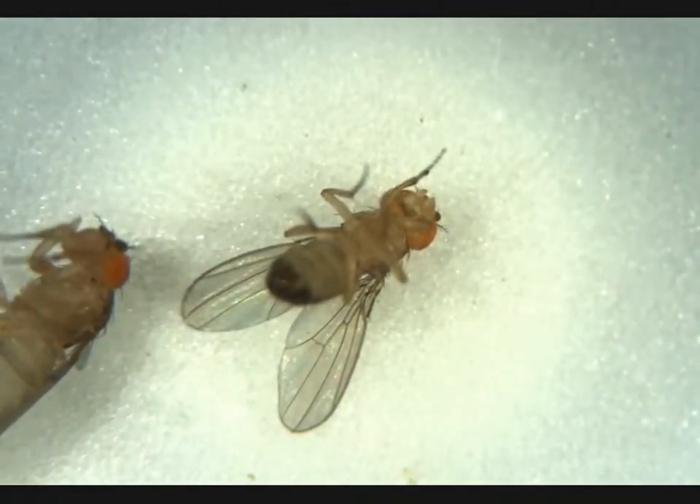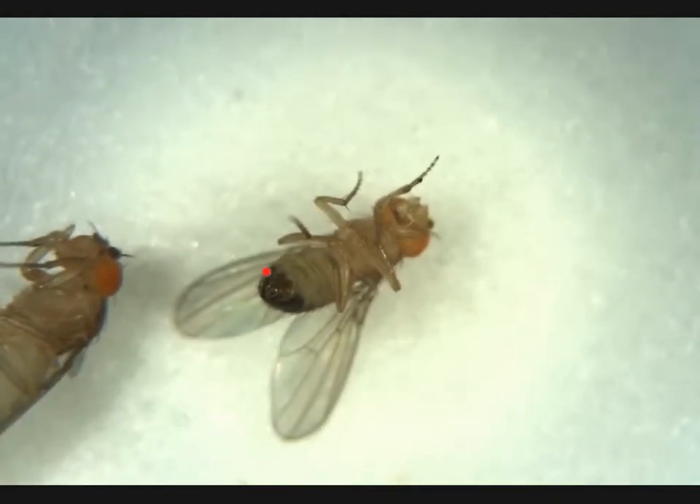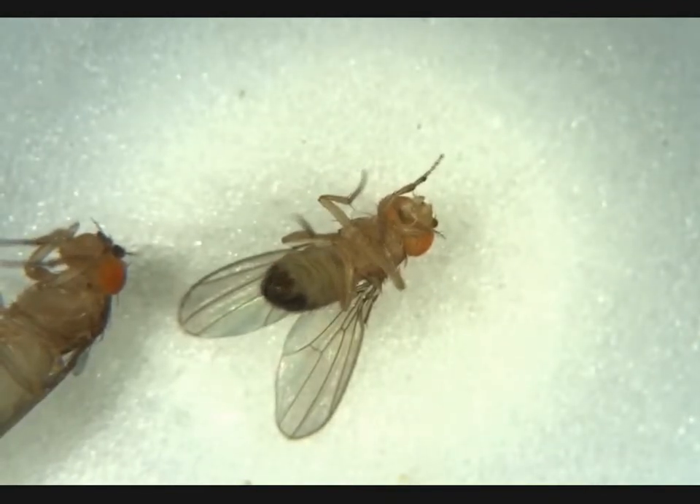This, once we adjust our focus, we'll see is a male. No obvious meconium, so it's an adult male, and here's its penis apparatus. Not what we're looking for.